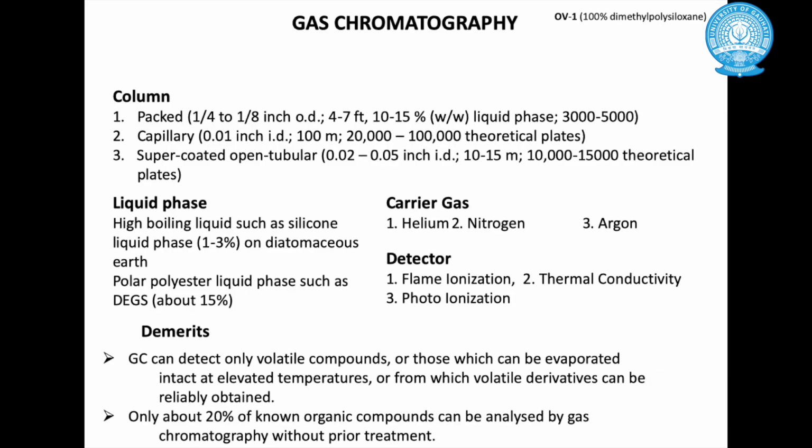So it has a dimension of 0.1 to 0.53 millimeters internal diameter, and the coated film on the wall of the column has a thickness of 0.1 to 8 micron.